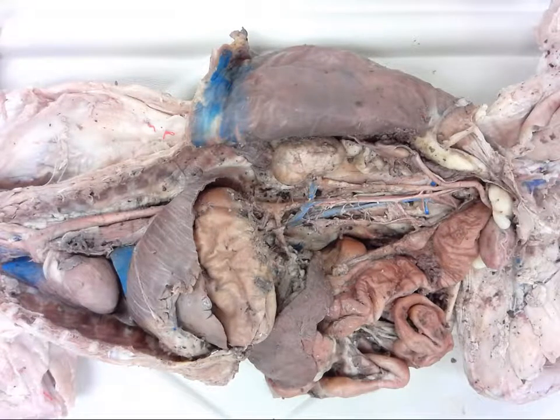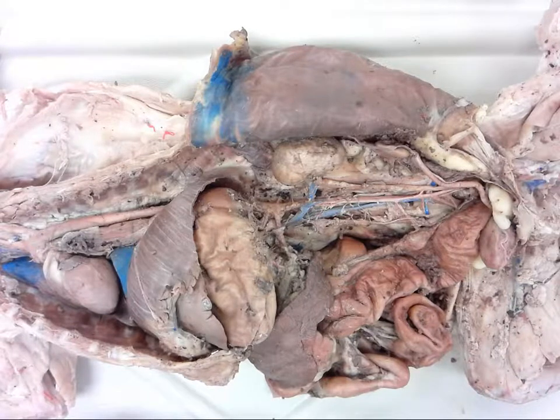Okay, class, in this video we're going to take a look at the abdominal, arterial, and venous systems.